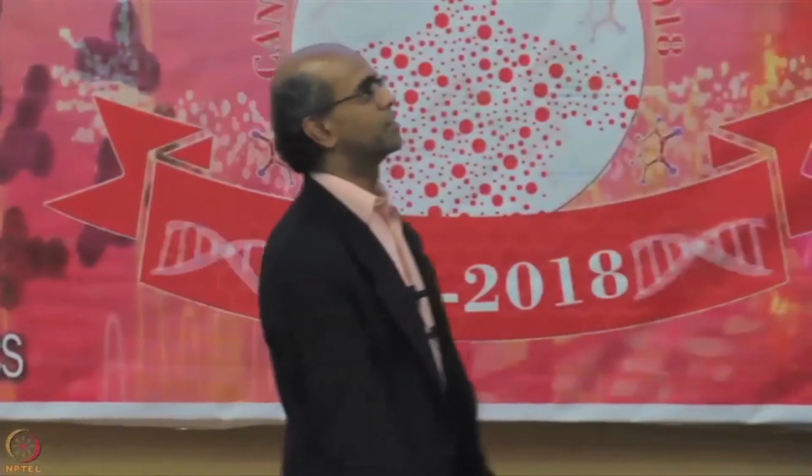So, the next topic in this set of slides is batch correction. We just talked about normalization, where we are trying to make all the samples similar. I don't know how many of you have heard of batch correction, just a few. Batch correction is something you apply when you have different batches of experiments you did and you think there might be a difference between those batches.